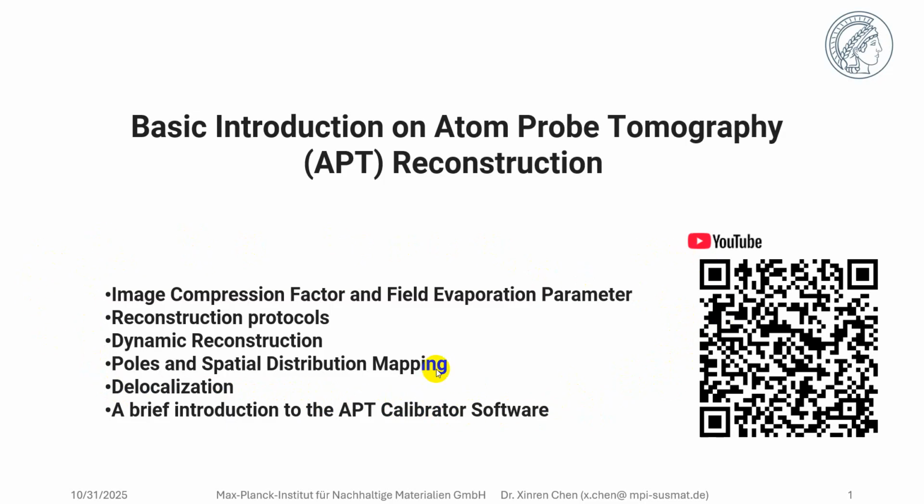So today, I mainly focus on the introduction of the APT calibrator software. Meanwhile, we will also include some principles of reconstruction.